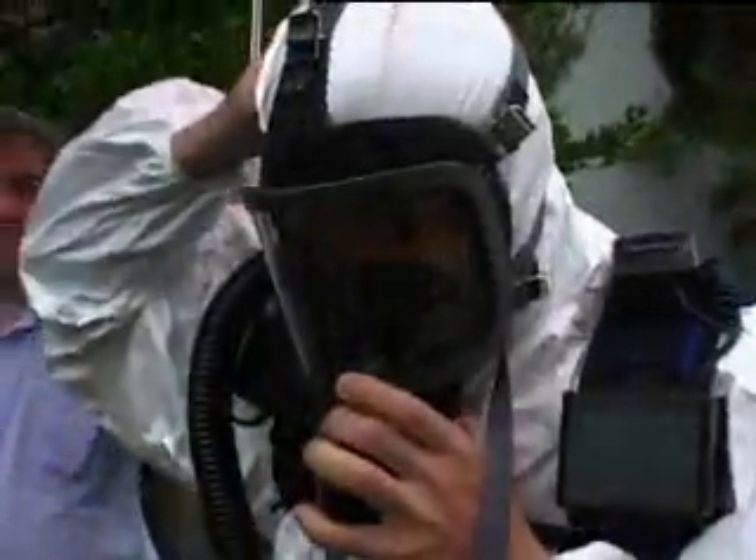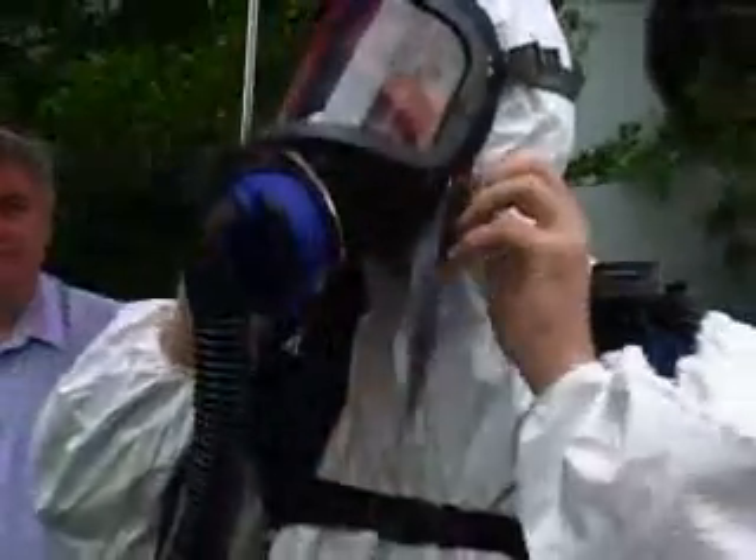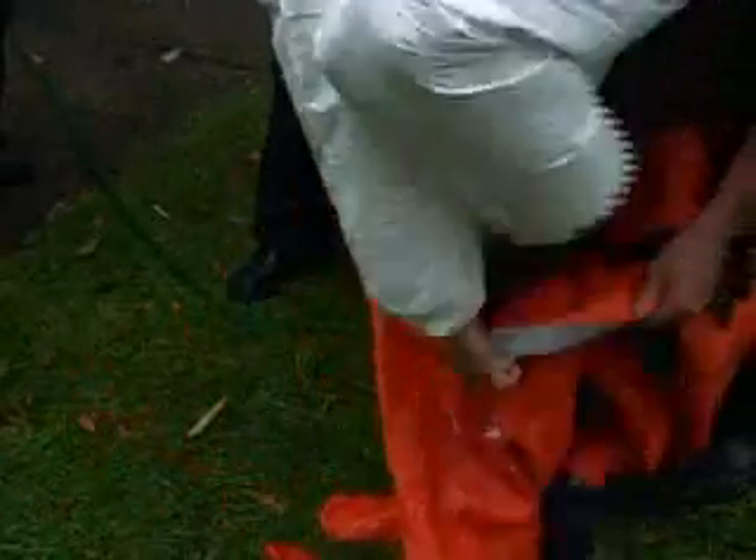In the second test, we use an SE400 positive pressure fan supplied respirator. The SE400 is integrated with a completely sealed suit. The respirator not only supplies air to the user, but also generates a positive air pressure inside the suit, which helps minimize inward leakage.